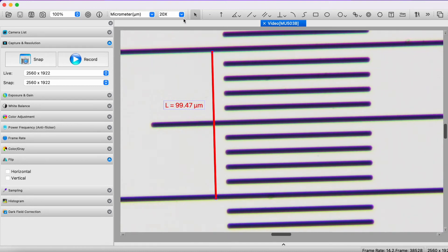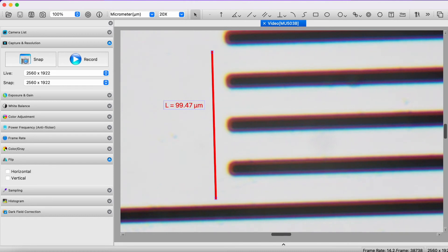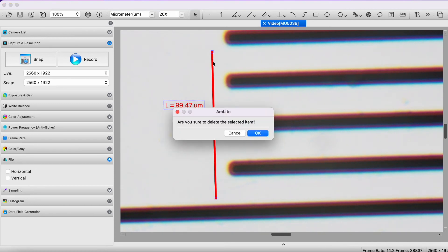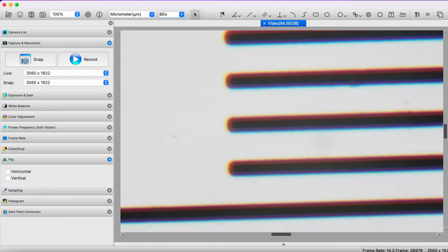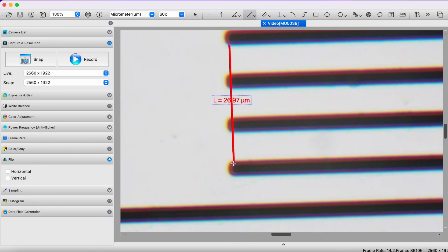Let's check out the 60x lens. I'm going to use the selector tool to click on the line I've previously drawn and delete it, and of course change the setting to 60x so the computer knows I'm using the 60x lens. I'll take my line function and draw a line — this line spans three demarcations, and each one is 10 microns. The software gives me 29.85 microns. Very good indeed.